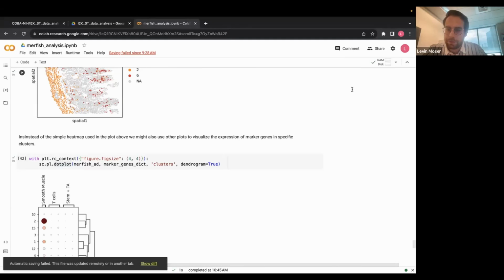Okay, the microenvironment analysis, I mean something like k-means neighborhood. Let me see what you mean. I think you could do k-means, but I haven't tried, so I'm not really sure if that's something you can do, but I think that they have it.